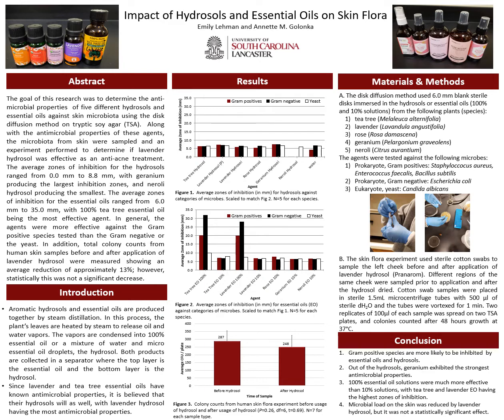The 5 essential oils and hydrosols used in this research were tea tree, lavender, rose, geranium, and neroli. Since lavender and tea tree essential oils already have known antimicrobial properties, I hypothesized that their hydrosols will as well, with lavender hydrosol showing the most antimicrobial properties.